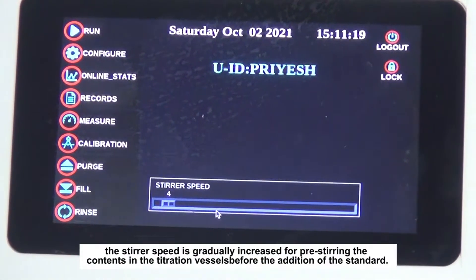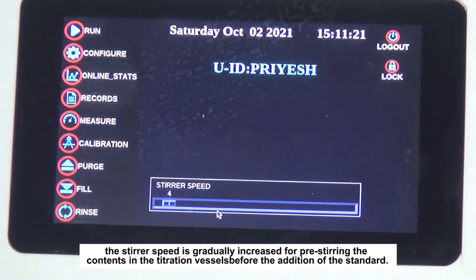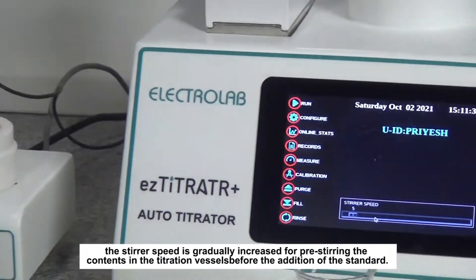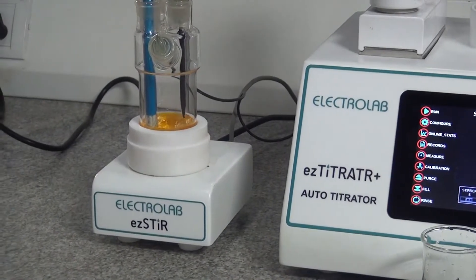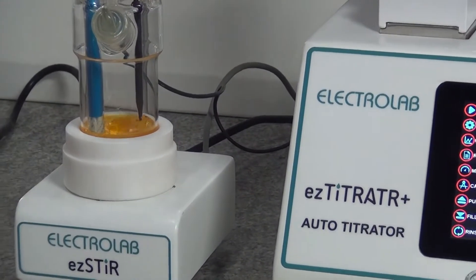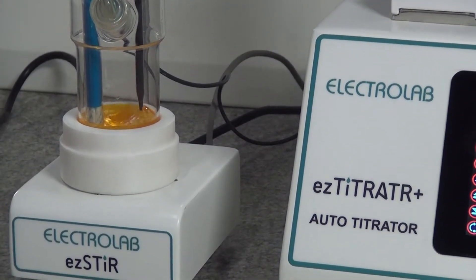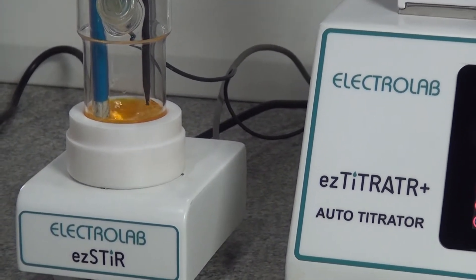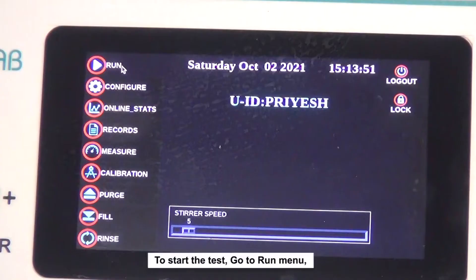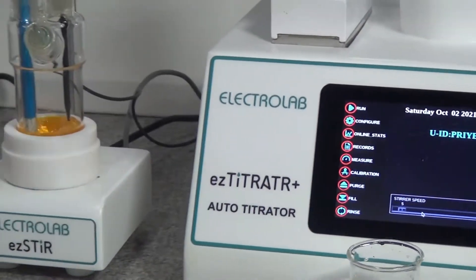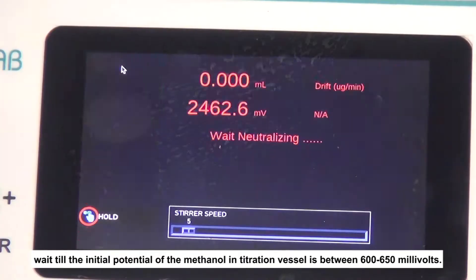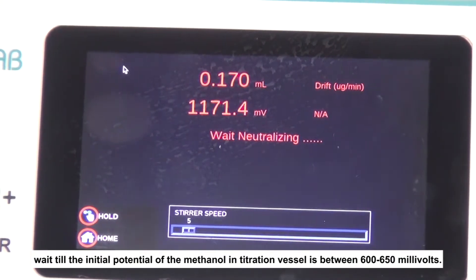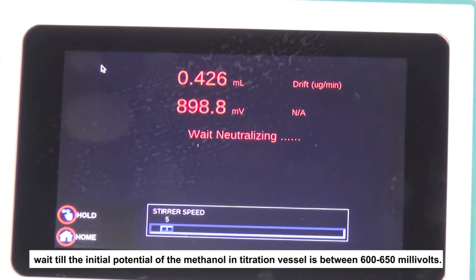From the home screen, the stirrer speed is gradually increased for pre-stirring the contents in the titration vessel before the addition of the standard. To start the test, go to the Run menu. Wait until the initial potential of the methanol in the titration vessel is between 600 to 650 millivolts.